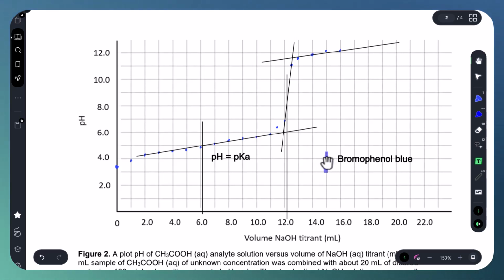And if you notice how this particular range lines up with the particular titration here, and think about it, if you were to do this titration without monitoring the pH, but just monitored the color change of bromophenol blue, which essentially starts at yellow and ends up at blue, well, you would have stopped the titration halfway through the titration, because this indicator would have already changed color at a pH of, well, roughly halfway through the titration, or even be prior to halfway through the titration. And so I hope you get the idea that bromophenol blue would not be an appropriate indicator to follow this kind of titration.